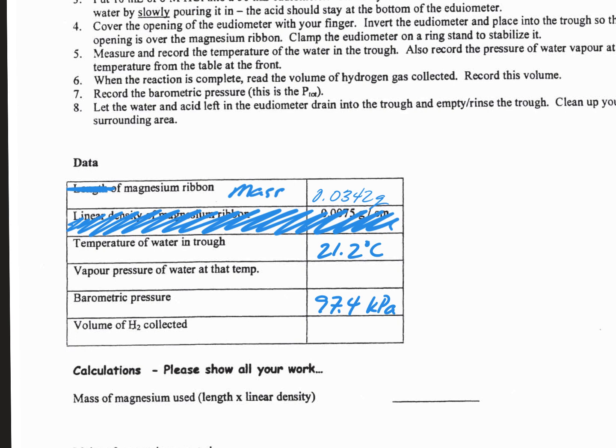We will come back to the vapor pressure of the water at that temperature in a little bit. The volume of the hydrogen that was collected was 36.5 milliliters. That's the data that we need.